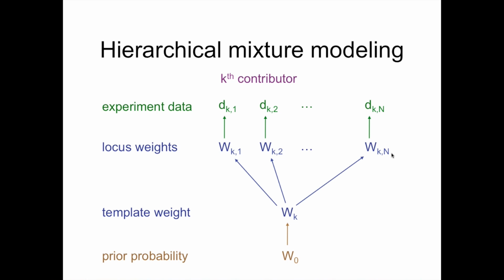And since these customized mixture weights at each experimental locus are already very close to the data in TrueAllele's hierarchy, as part of the 100 variables that it's looking at when it's solving an STR mixture problem, the template weight and the effect of degraded DNA isn't as great as it would be if it were a non-hierarchical model. So just by having hierarchical mixture modeling, the computer's largely getting it right, and accounting for decay factors is just additional icing on the cake.